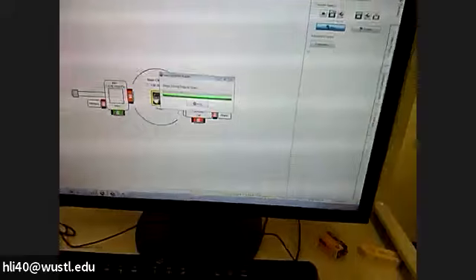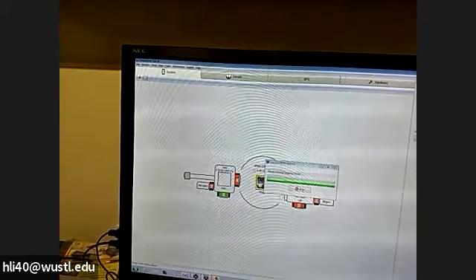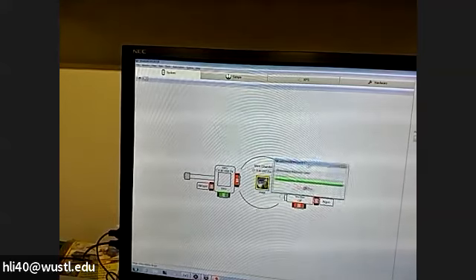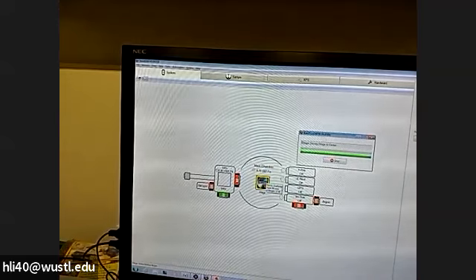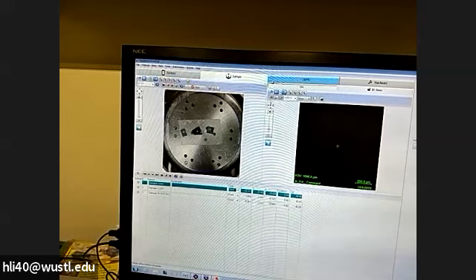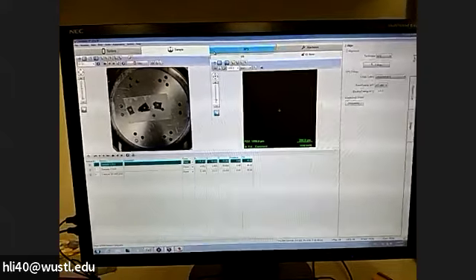All right. The next few steps are just setup. If your sample is clean, we should see the pressure come back to the -7 Pascal range right away. It takes a minute to move the plate to the stage center. Now the next thing is we come to the sample. I'm going to adjust the camera a little bit so you can see better.